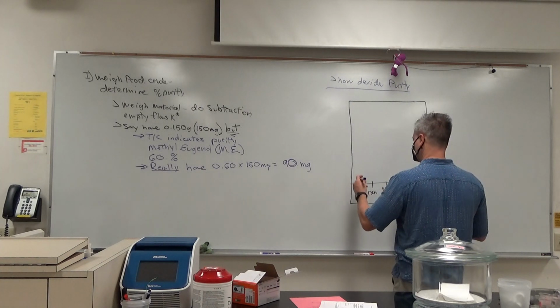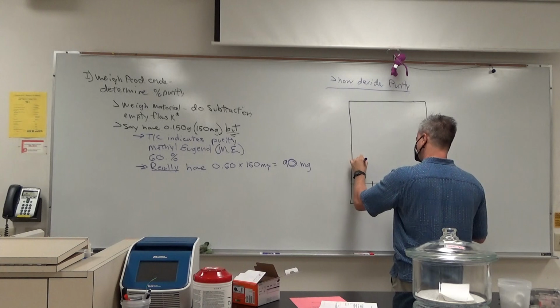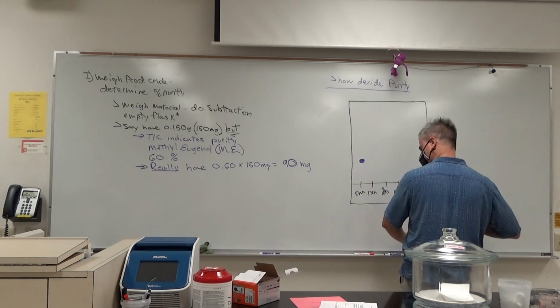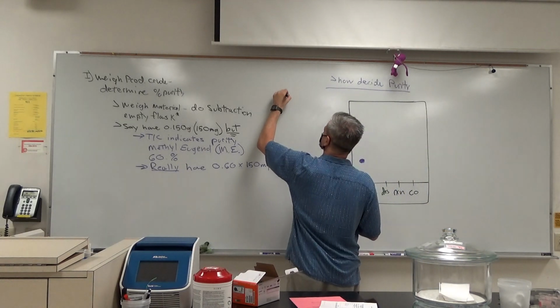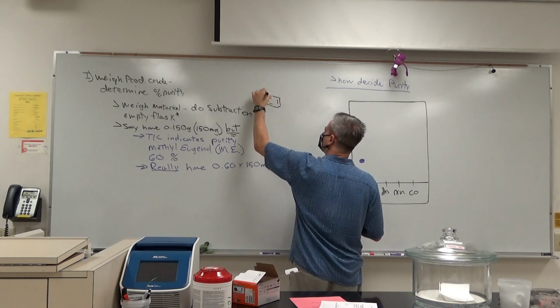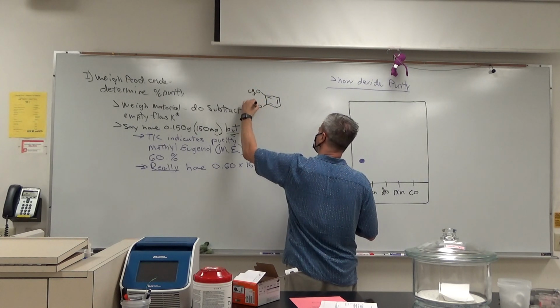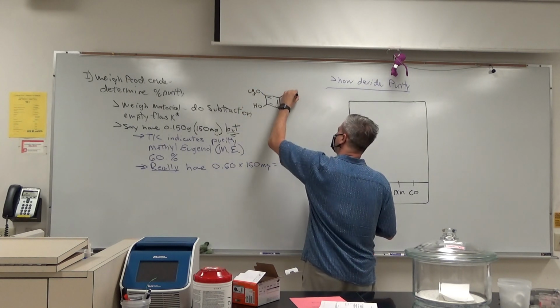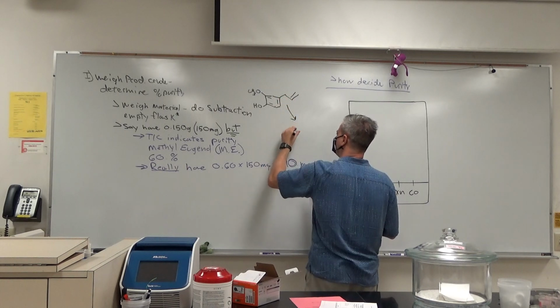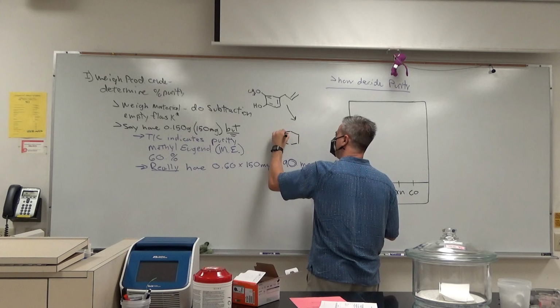Let's remind ourselves real quickly of the structures. That's eugenol, the starting material.